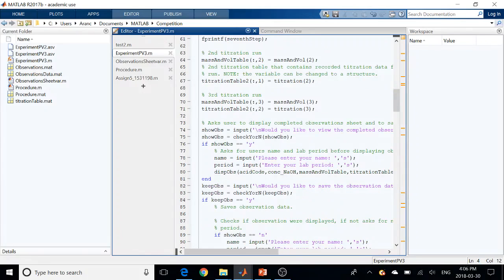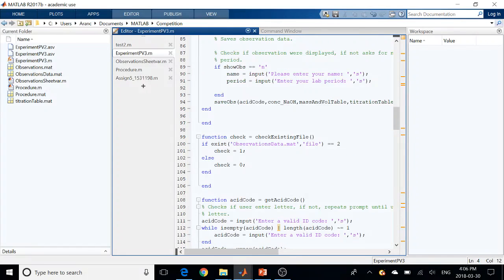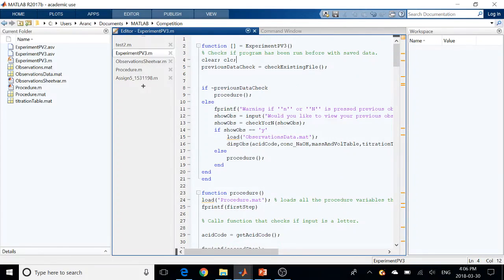However, there were problems encountered while dealing with large text files without using a low-level programming language, and we were able to solve that problem by saving parts of the text into multiple variables and then using the function fprintf to execute our procedures. Also, the text was initially saved onto a separate text file and then was brought into the program later on using load. However, in the earlier versions, we used the text directly in our programming script, which made our program very long.